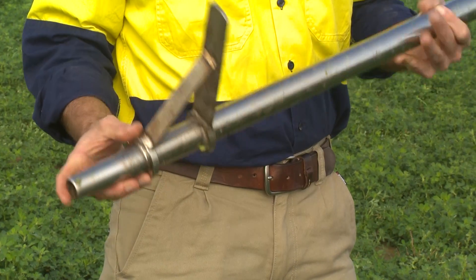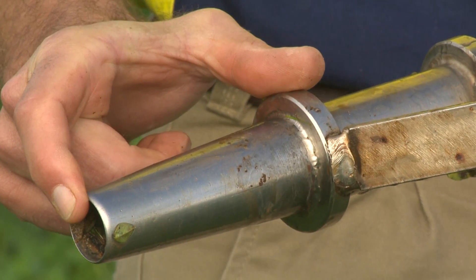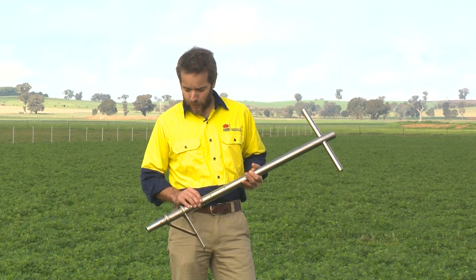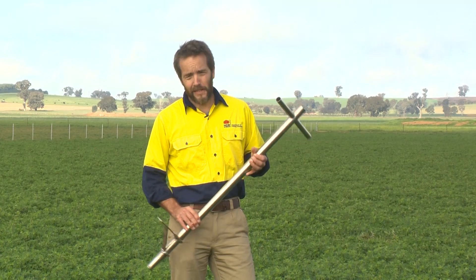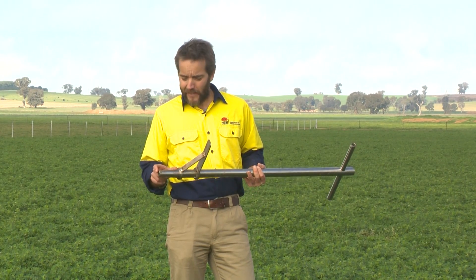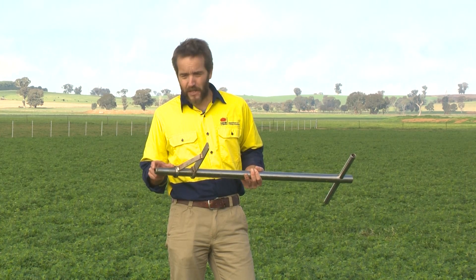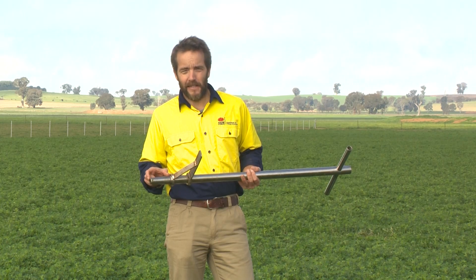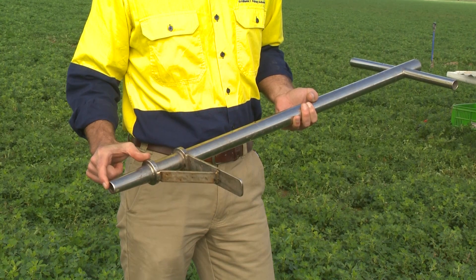Most people are familiar with taking soil samples with one of these — a foot corer or pogo stick — which takes a 0 to 10 centimeter soil sample. You can also get longer ones to go down to 20 centimeters. These are simple to use, but their limitation is that they take the whole sample and average and mix the soil within that depth, and there are problems with that.